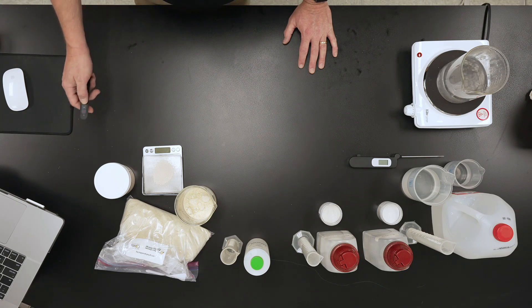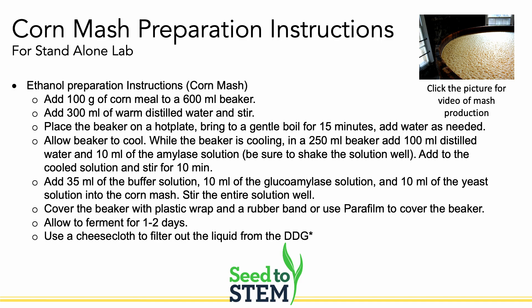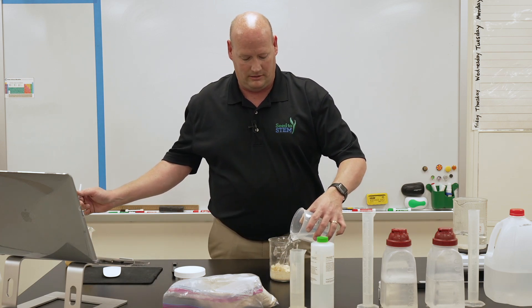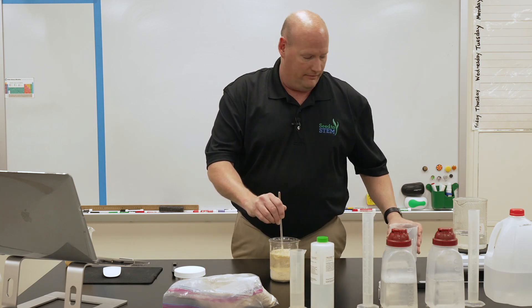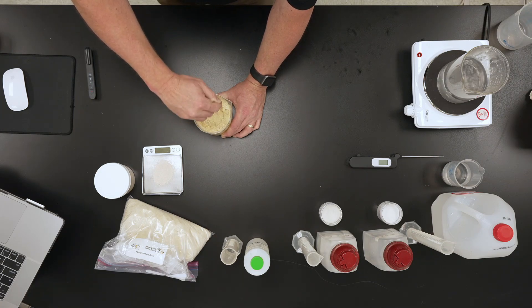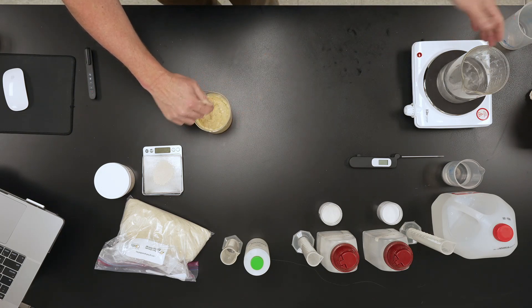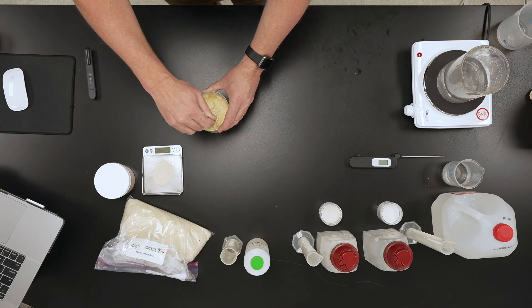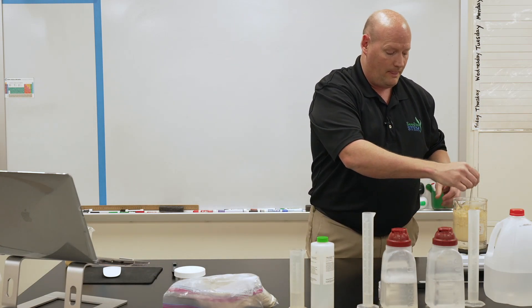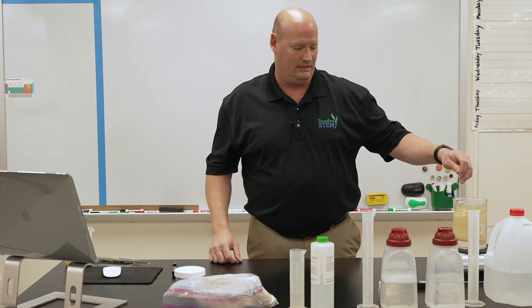The first step is to get our mash ready. We have 100 grams of ground corn in our bucket or beaker, and we're going to add 300 milliliters of distilled water. Give that a little stir. Then we need to heat this up. We have a water bath — a 1000 milliliter beaker with boiling water — and we're going to set our beaker right inside to give it a little bath. This is going to cook for about 15 minutes, or until we get a thick oatmeal consistency.